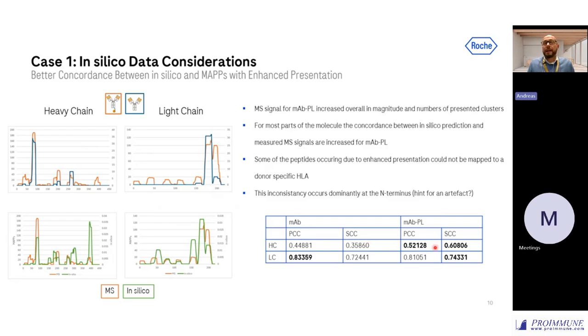Here it's probably, again, two counteracting forces. On one hand, the concordance increased because we see the clusters that now nicely correlate, but we also pull down the correlation if you have signals like this. But on the other hand, from a safety perspective, it's always better to be immunosafe than sorry. So from that perspective, that wouldn't be much of our concern.